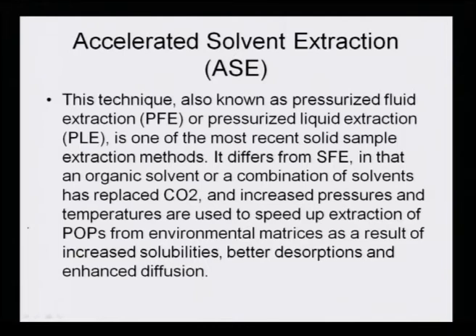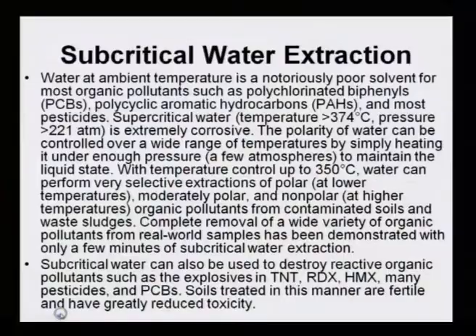So, we came to know about two fast methods of extraction. One is supercritical fluid extraction and the second one is accelerated solvent extraction.